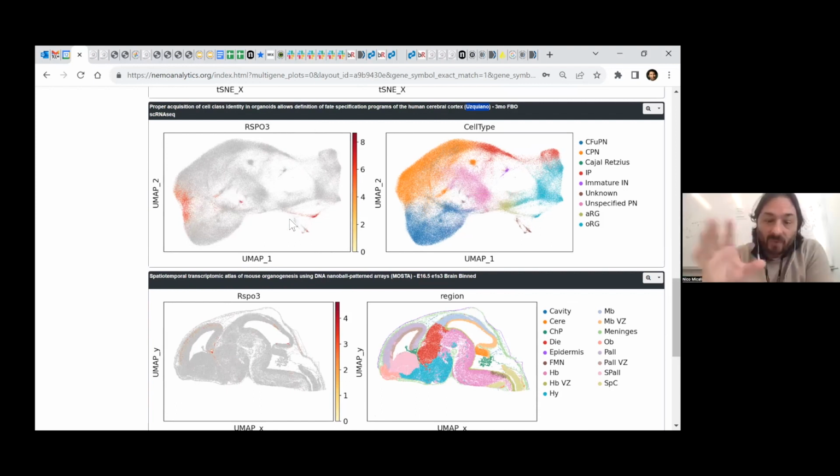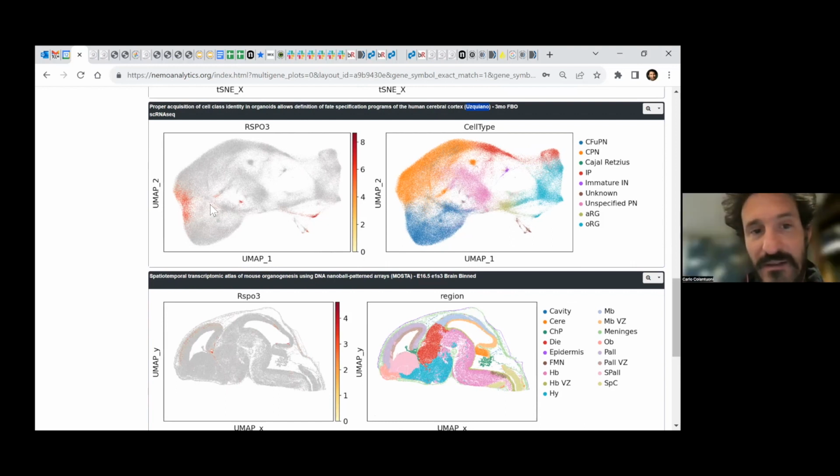Yeah, in the occipital area, I'm talking about these are regionalized. It's interesting. It's a regionalized gene, right? But it's not through everybody though. It's through the trajectory at different stages, but in very discrete subpopulations. Maybe it's still serving some kind of guidance role in a different way.